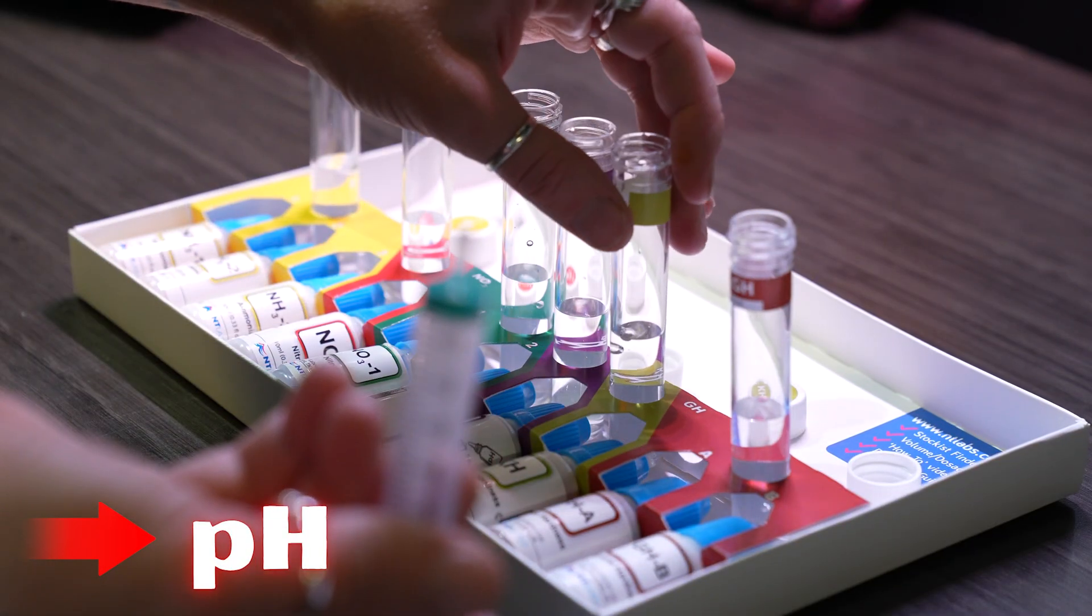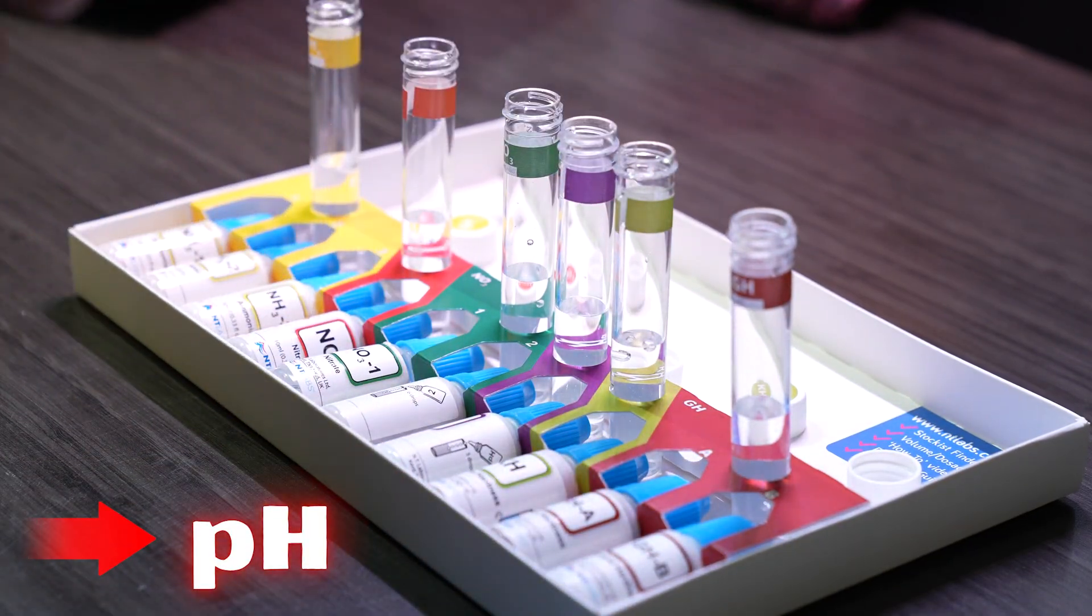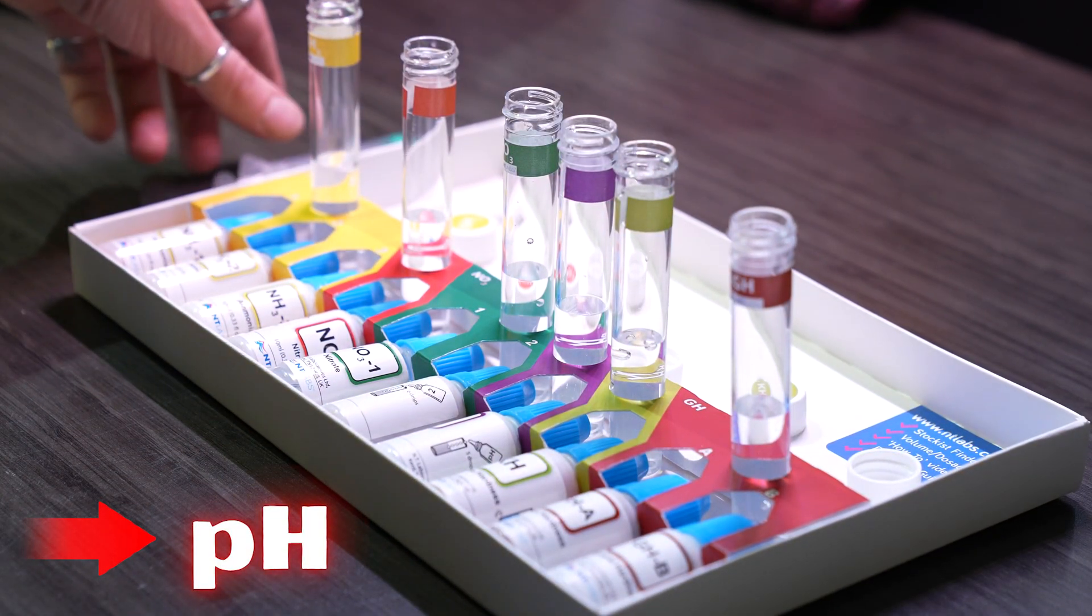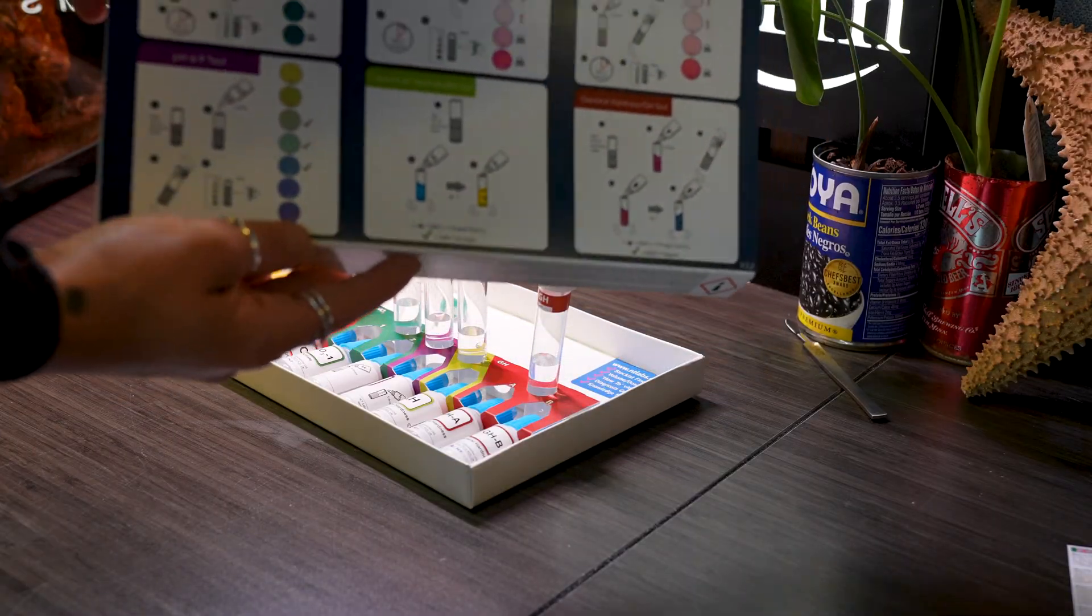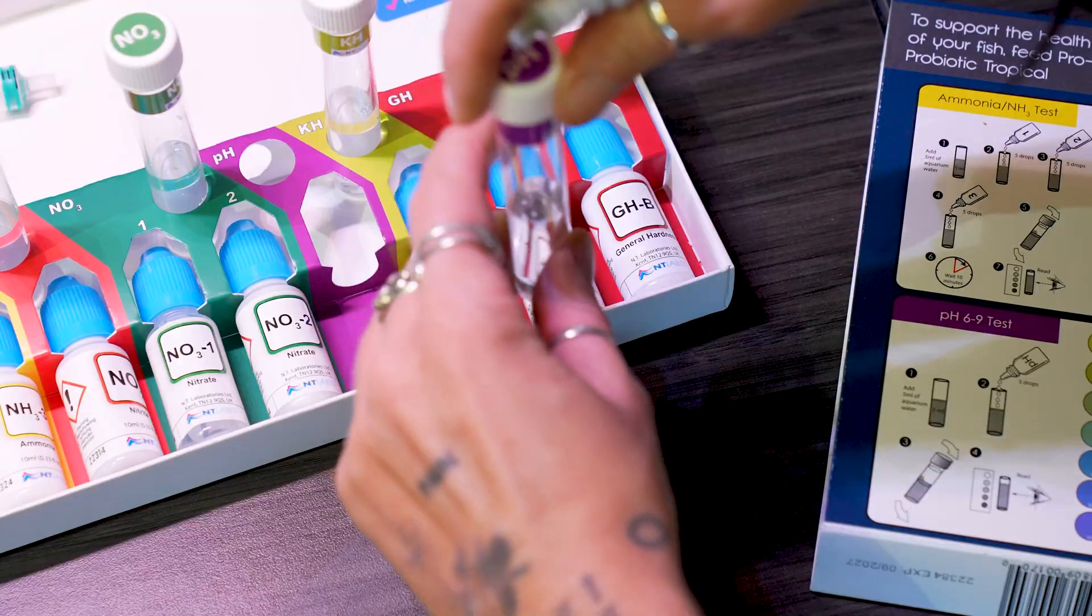For no practical reason, I'm going to start off with pH. pH is the measure of alkalinity or acidity in the water. If you flip the box around, you'll see it has super clear and easy to follow instructions.